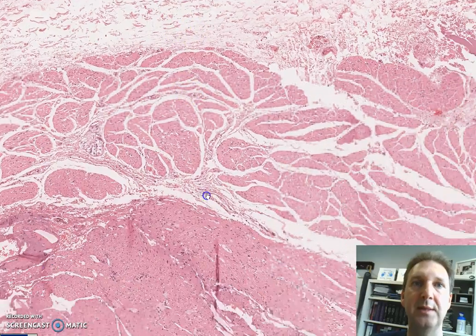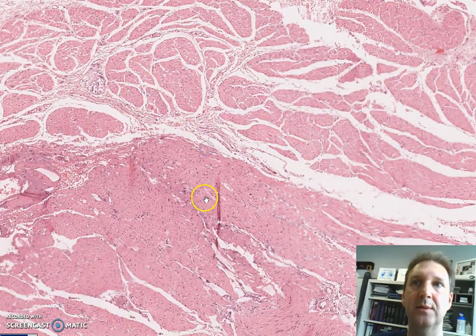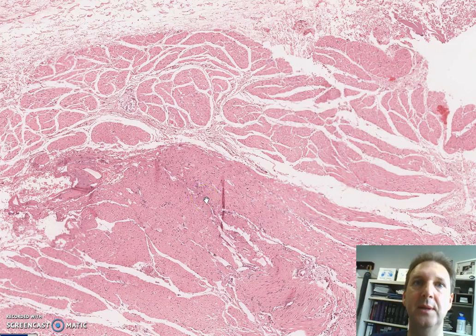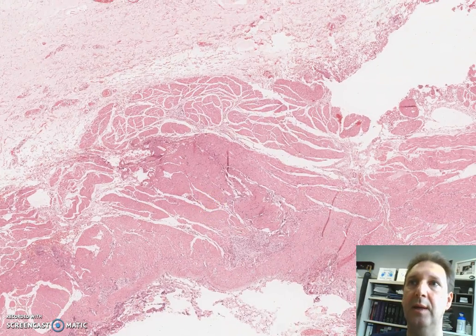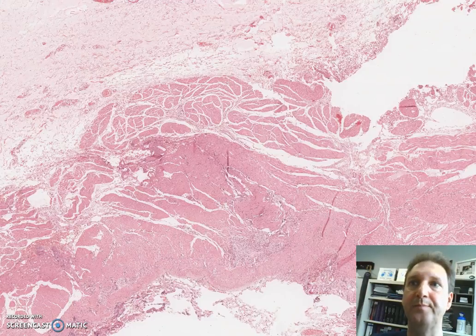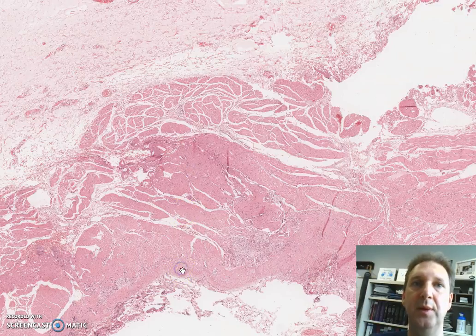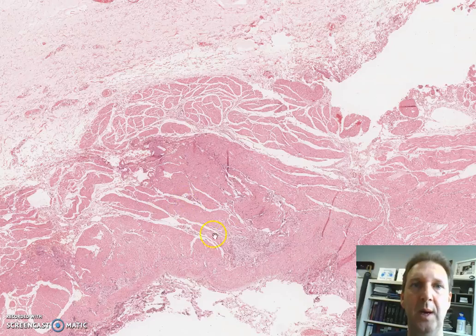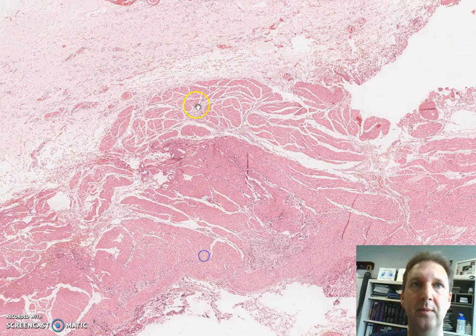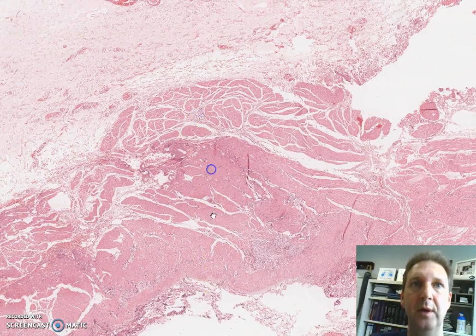If we continue, we can see the three muscular layers right here, which are the oblique, the circular, and the longitudinal. They blend into each other, so it's hard to see where one starts and the other ends, but we know there are three of them.